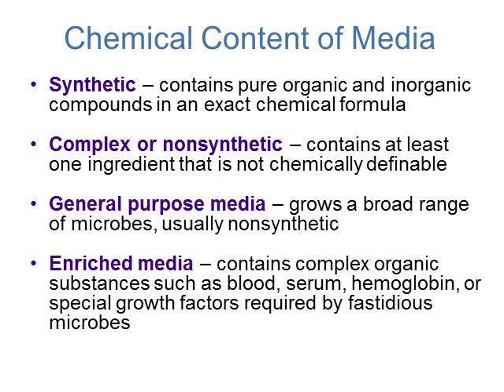For the chemical composition of the media, you can have synthetic media. This contains pure organic and inorganic compounds in an exact chemical formula. So with synthetic media, we know exactly what is in it. You can also have complex or non-synthetic media, where it contains at least one ingredient that's not chemically definable. So you can have synthetic or non-synthetic media.